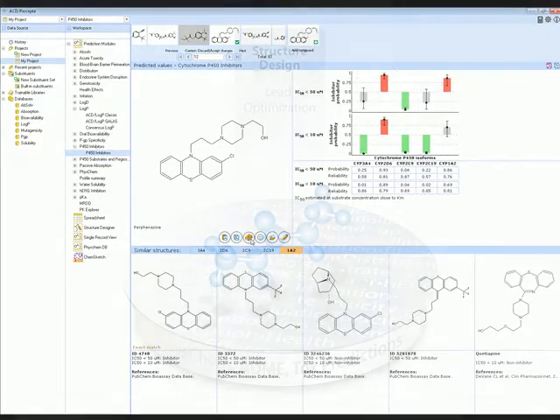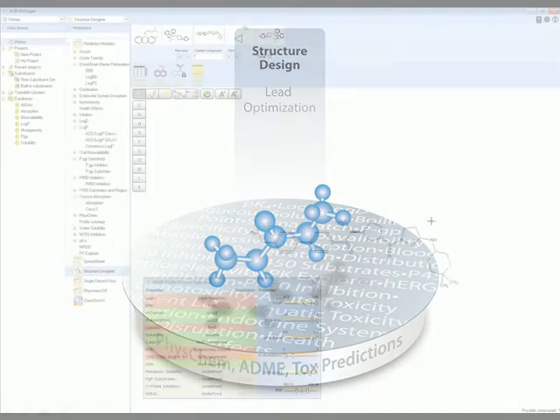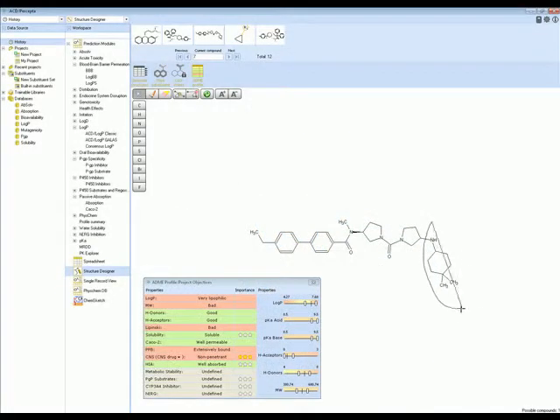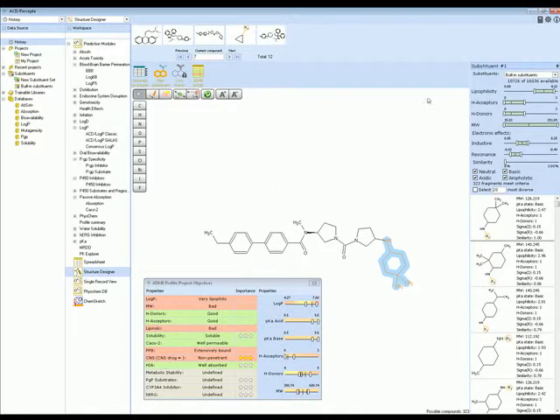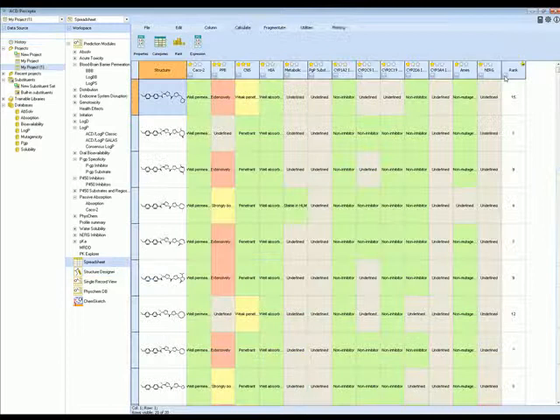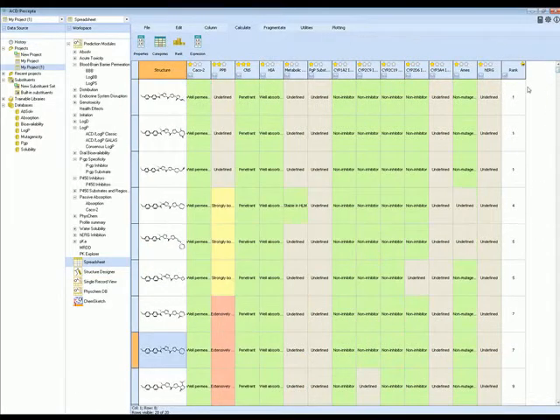Optimize structures to improve their property profile using the structure design engine. Select one or more substituents for modification and adjust the property profile to desired ranges. The software investigates substituents that will alter the property profile accordingly. Use various tools to help filter and sort generated analogs, and guide synthetic efforts towards compounds with the desired property profile.